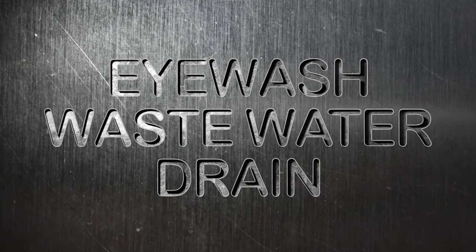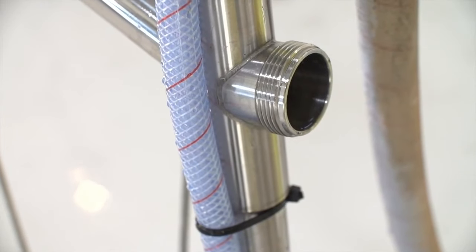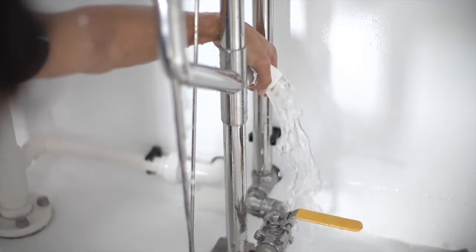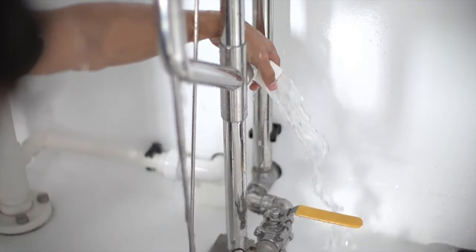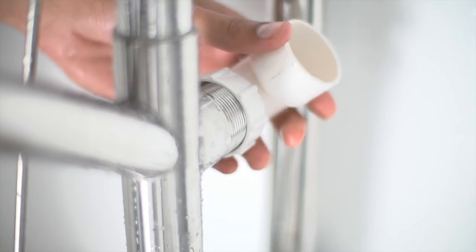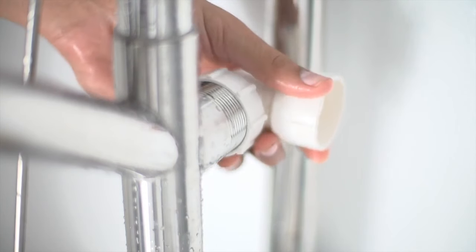Eyewash wastewater drain: Debris build up in the drain means costly maintenance. Ashley's drain is non-blocking and allows the water to pour harmlessly onto the ground, or it can be plumbed away with PVC one and a half inch BSP fittings so contaminants may be disposed of safely.